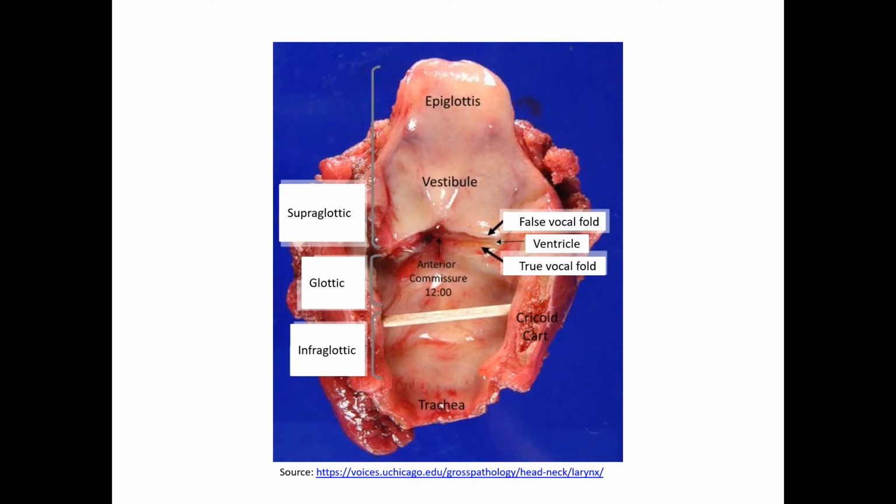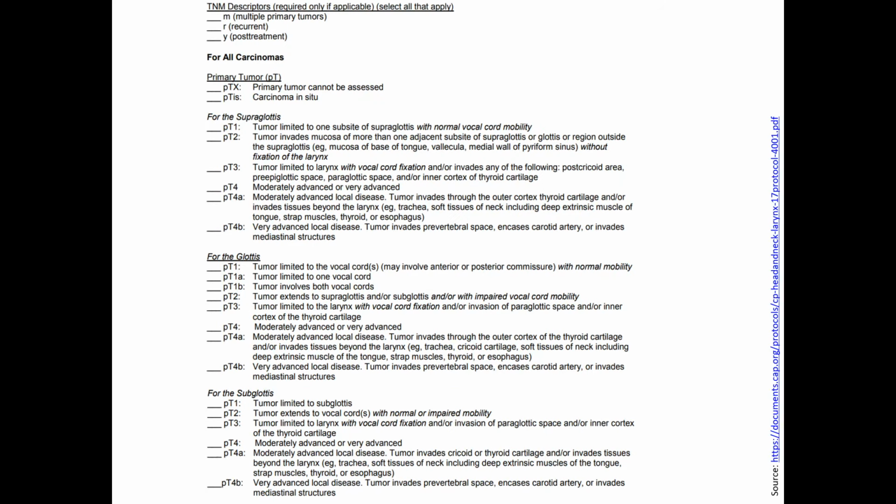Okay. So you mostly rely on the gross to determine whether a tumor is supraglottic versus glottic versus infraglottic. Yes. And I'm assuming that pictures are very helpful here. Yeah. Pictures are always helpful in head and neck, particularly in these very complex specimens, maxillectomies. It's the same story for hemifacectomies, mandibles. Any time it's a complex specimen in the head and neck that's essentially not part of a tongue coming off as a partial glossectomy, it really does help to have photographs of that.